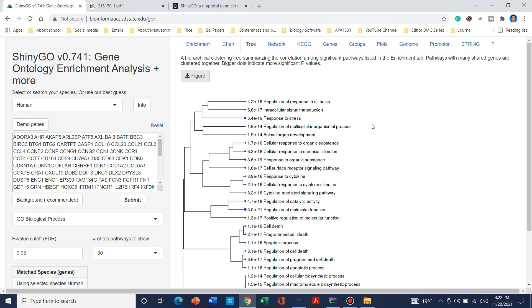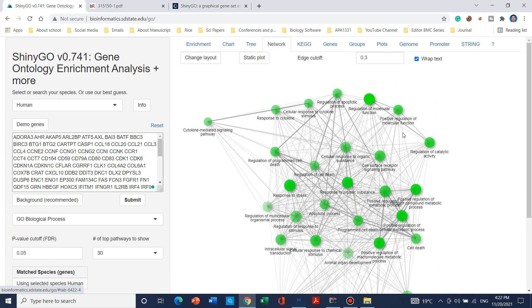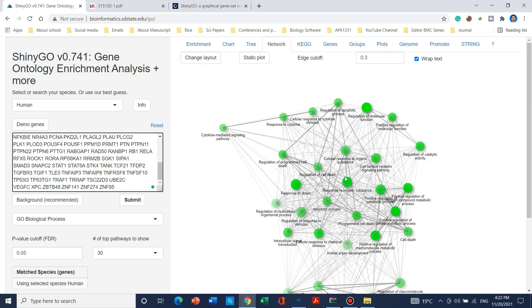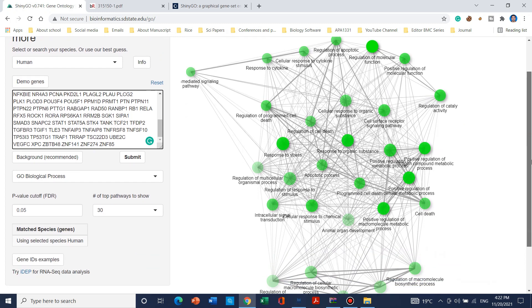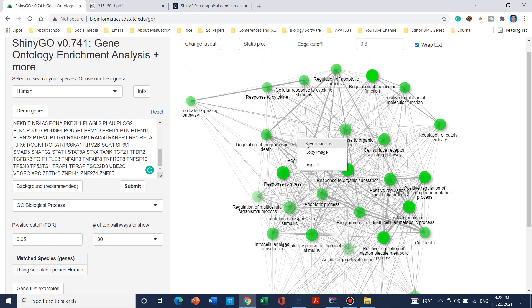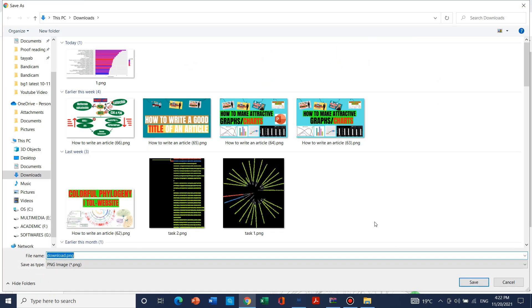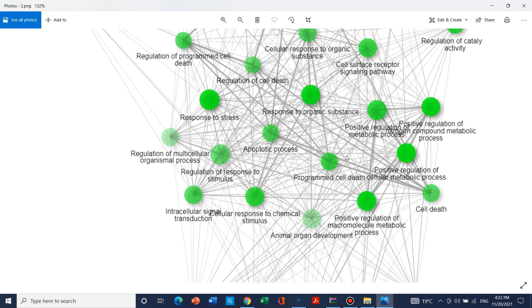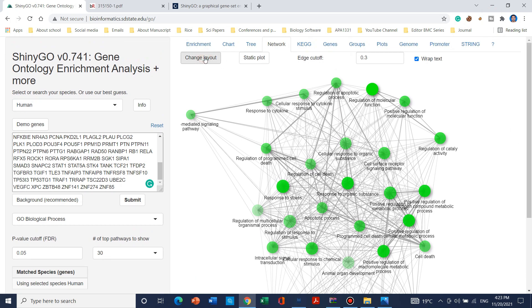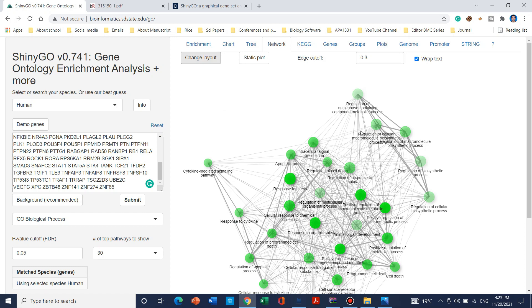Moving to network analysis, you can also check how the genes in this dataset are interacting in a network and how they control the phenotype according to GO biological processes. To save the network, left-click and save as image. You can also change the network layout by clicking the layout button, which can be adjusted according to your interest.